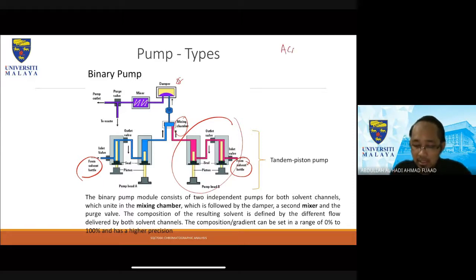In my case, the one I normally use is just acetonitrile in water. You might also use methanol in water, maybe not the best, or hexane in ethyl acetate.